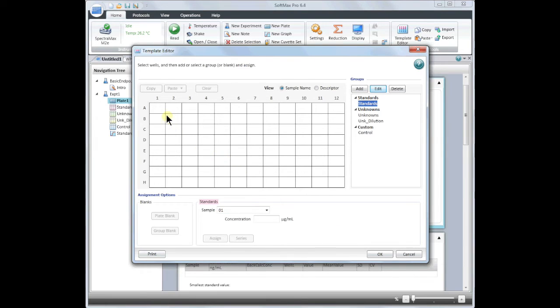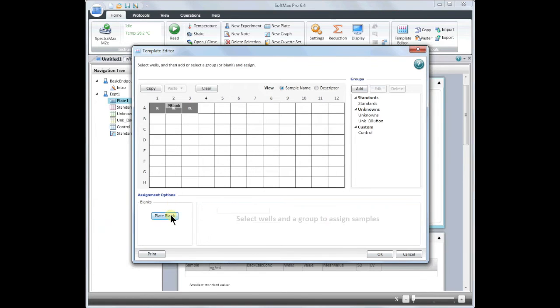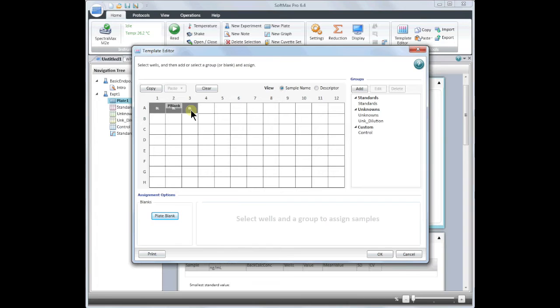I will begin by setting up a plate blank. To do this, highlight the wells where your plate blank will be and click plate blank. The values read in these wells will be automatically subtracted from the values in the rest of the wells. But don't worry, the raw data will always be saved and you can always make changes to this template.